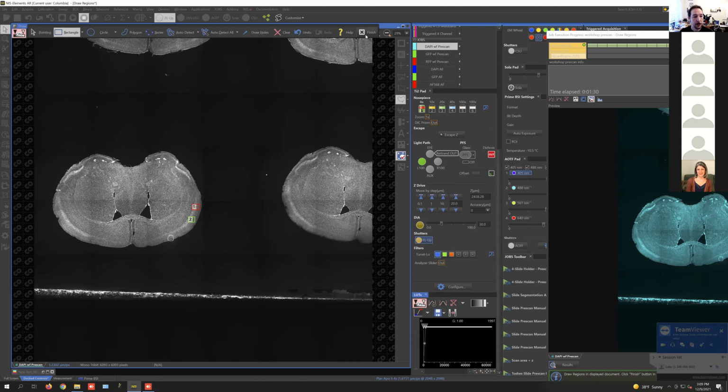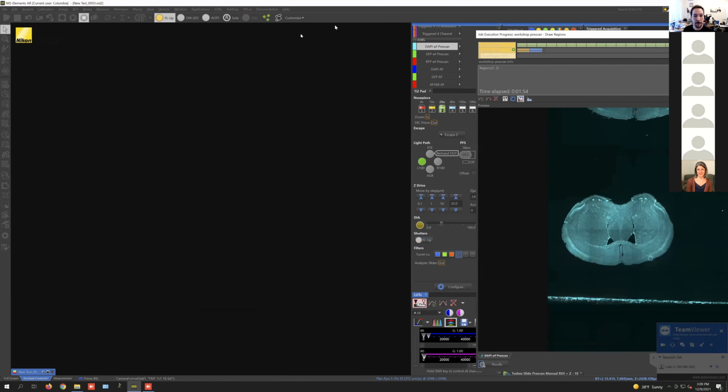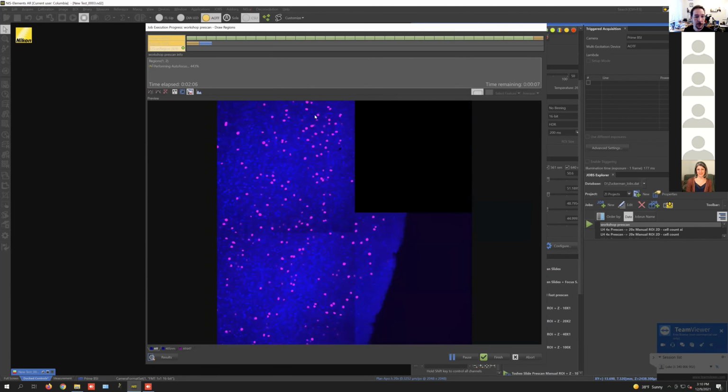So if you are doing a project like that where there's something visually clear that you want to isolate, it's worth investing a little bit of time, and I'll show you how to do that in a minute, to train a network and potentially have something that's very automated for doing something that would otherwise be very time consuming. So I'm clicking finish so that it goes to image those regions. I'll move this back so we can see it. And we're doing the autofocus now. And then we're doing the tiled image.